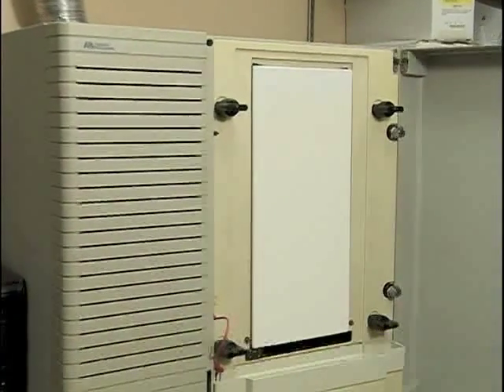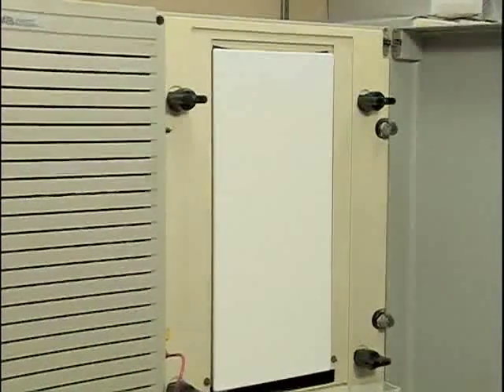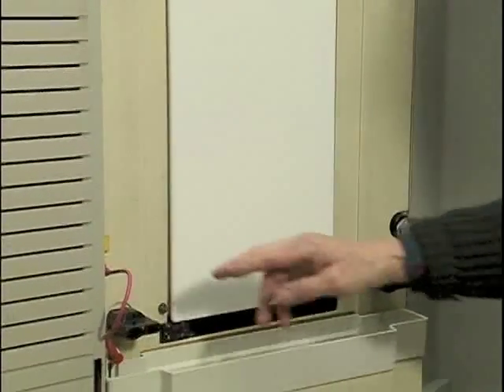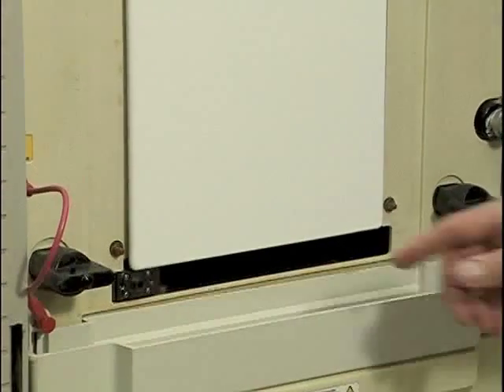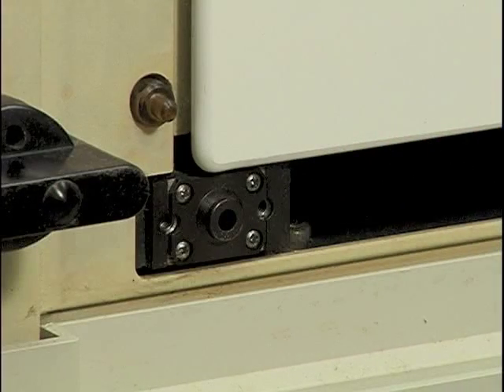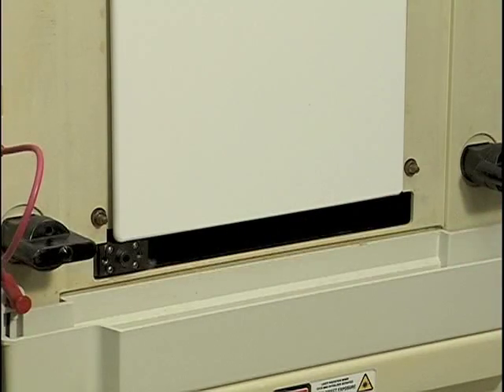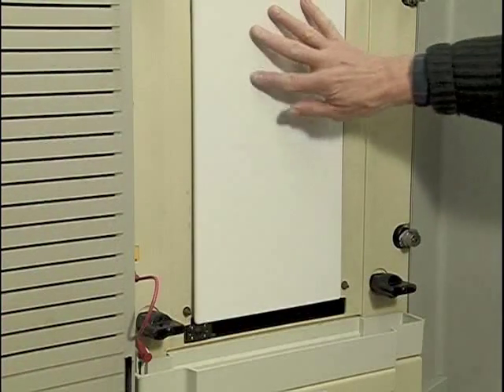Just like the agarose and PAGE gels you have done in class, once the charge is applied, the negatively charged DNA fragments will migrate towards the positive red electrode, being separated by size as they migrate. Eventually the fragments will migrate past the read window, which you see here. This small black object is a laser. It will scan back and forth across the read window as the gel is running. The light from the laser will strike the dyes attached to the terminator molecules, they'll fluoresce, and the signals will be picked up by a CCD camera that is behind here.